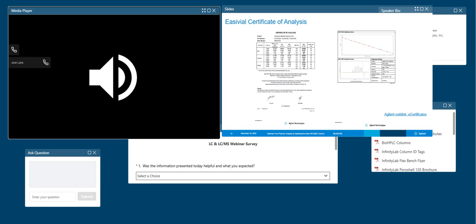For each colored vial, you can see an example sample chromatogram is depicted in color, showing the separation of the 4 standards. In addition, a full calibration plot is also provided.